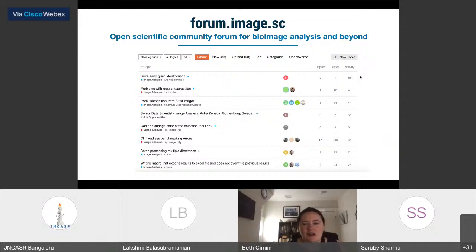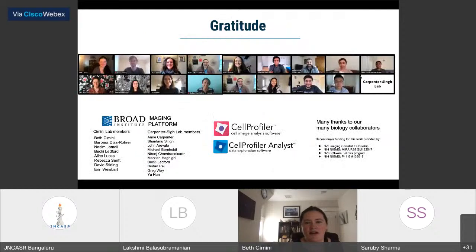And finally, if you have questions about image analysis for profiling or for CellProfiler or for anything, we invite you to come to forum.image.sc, where 50 different softwares all share one common forum for help, and you can upload a picture and say, I need to find out this information. How can I do so? And you have experts from all of those tools who are there together and can help you sort that out.